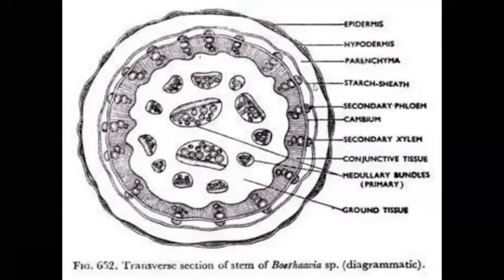cambium rings are developed from the starch layer or inner cortex. The abnormal cambium rings produce more abnormal cambium rings to the outside of the stelar region. They produce secondary xylem to the inside and secondary phloem to the outside. These are the abnormal characters.